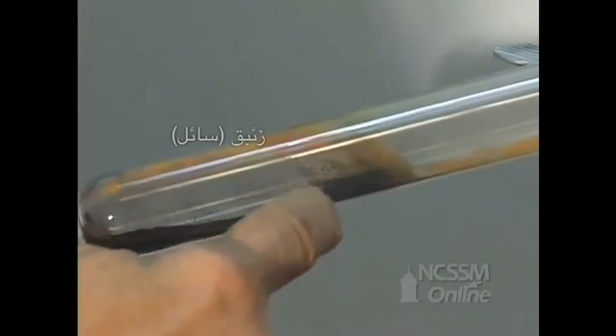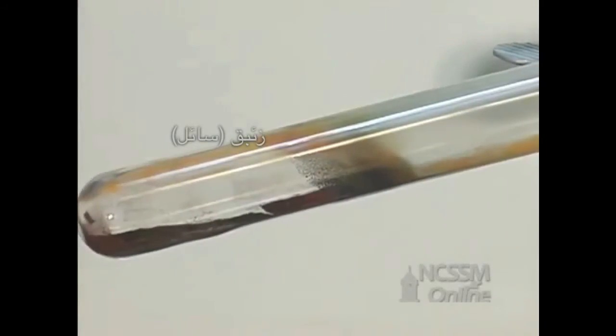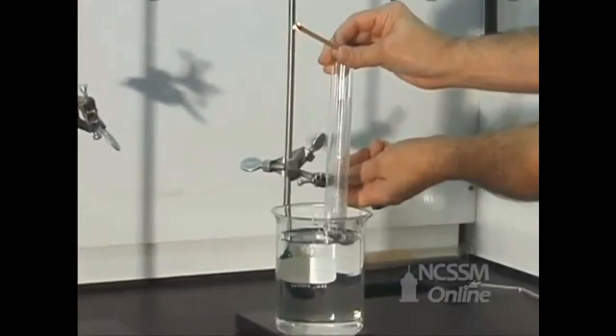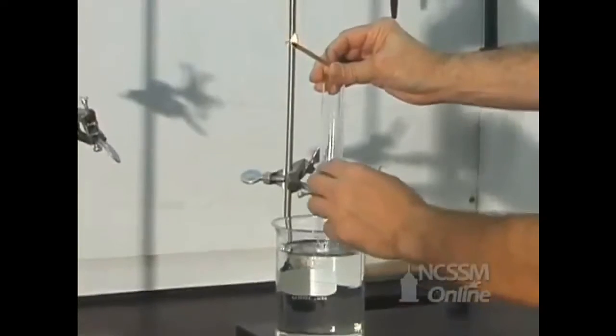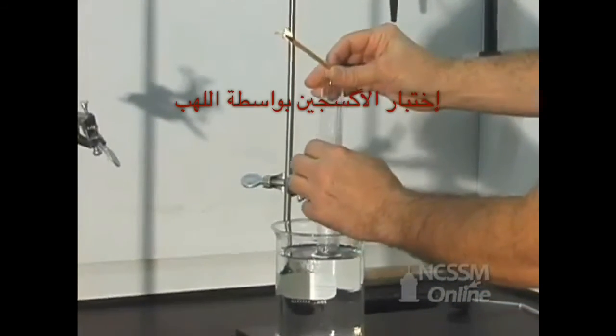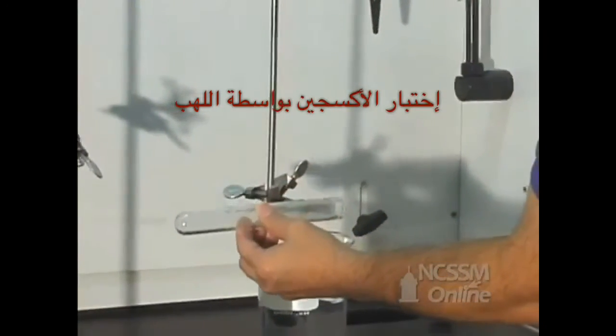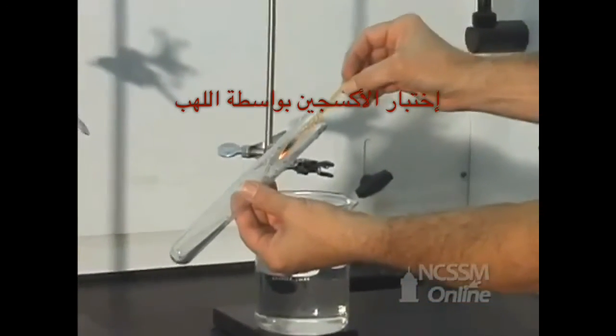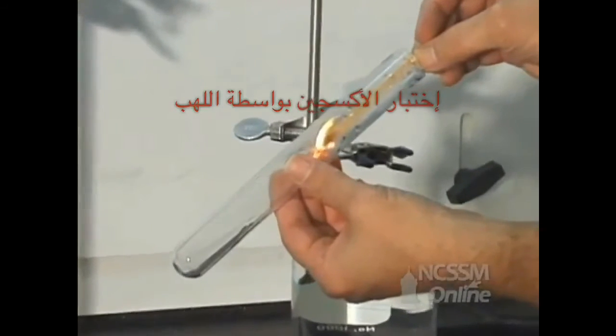The mercury metal we can see as a metallic gray ring in the test tube. We can demonstrate that the gas collected is oxygen by testing the gas with a glowing splint. As the glowing splint is brought into the test tube, the combustion accelerates in the oxygen and the splint reignites.